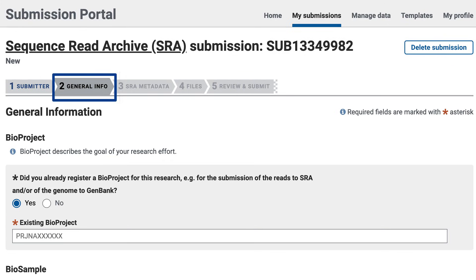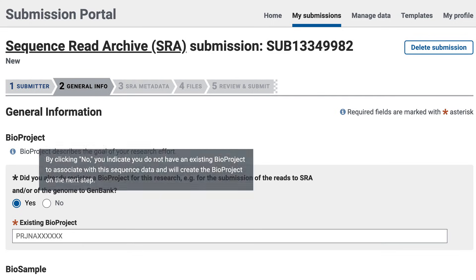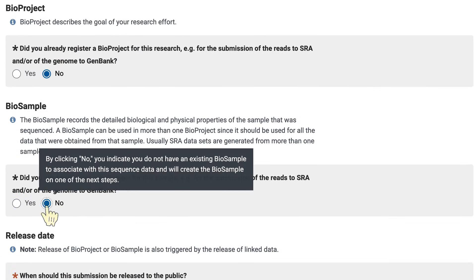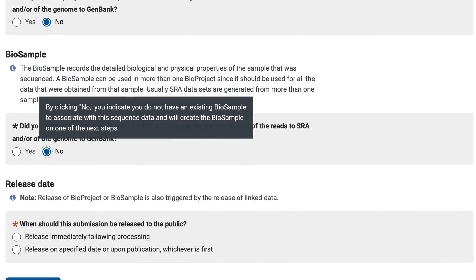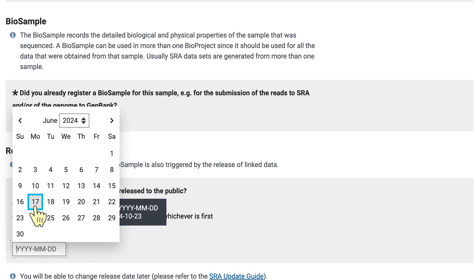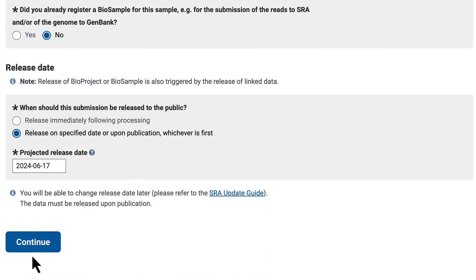In the General Info page, since I am creating a bioproject and biosamples within my SRA submission, I'll select No for both here. I'll be adding those data in the next page. I don't want these data released immediately following processing, so I'll select a release date about one year in the future, and click Continue.